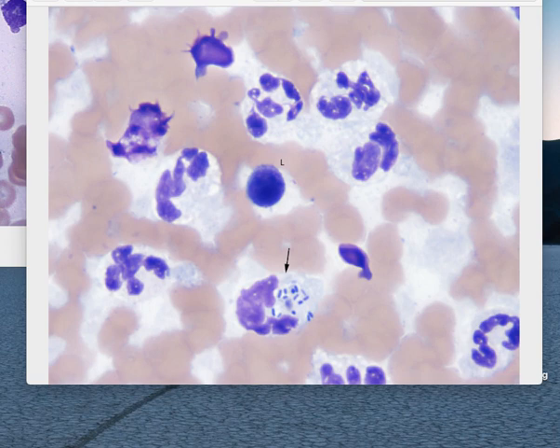Okay, another area that we have to go to, especially when dealing with effusions, is, when we talk about inflammation, is the inflammation septic or not? And most often when we have an effusion that's septic, it means that there is a bacteria present. We do need to see that it is intracellular as well as extracellular. This is intracellular bacteria. And the neutrophils become pretty unhappy at this point.